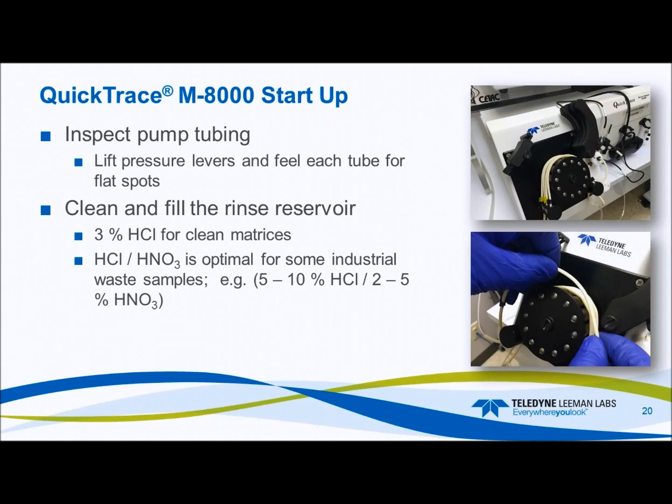If you don't do a lot of these things, then your system becomes not in control, and then you have to go through the process of troubleshooting, trying to source the contamination and get your system back into control. Once you have your laboratory in control, it's very important to keep that logbook so you know when new chemicals are coming in, you know what pipettes and vessels and everything that you're using to create standards. It's very important to log those, serialize those products, so you know which one you're using each and every time you make up standards, because if you don't have that audit trail, when you find your system is out of control, you can be down for 2 or 3 days trying to source this contamination and to mitigate it so you can get your system back in control.